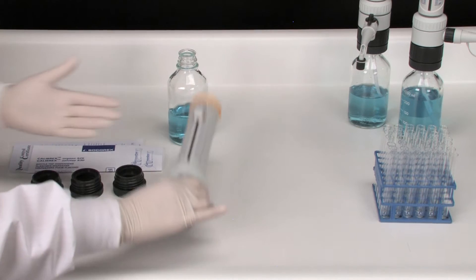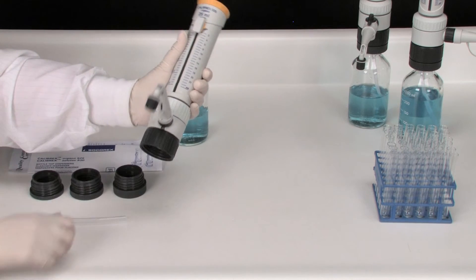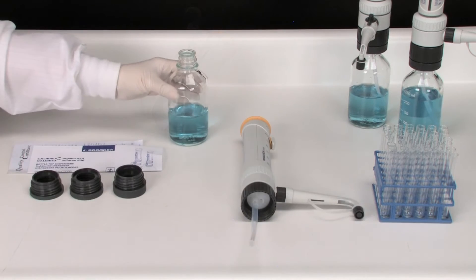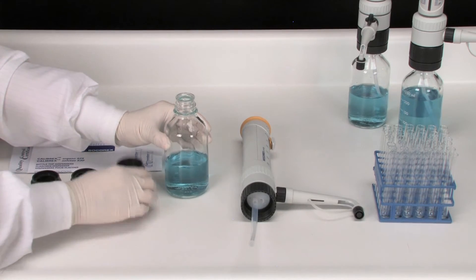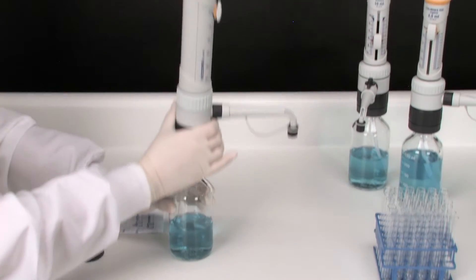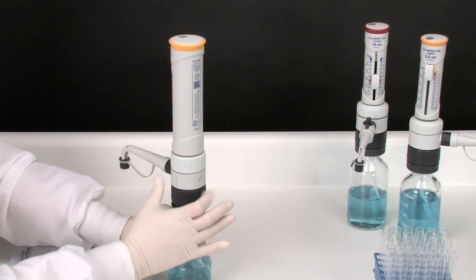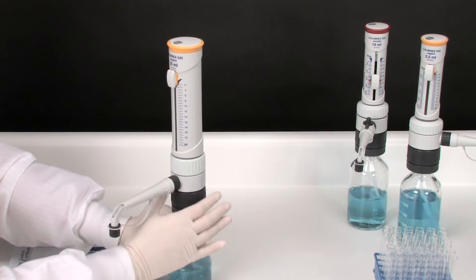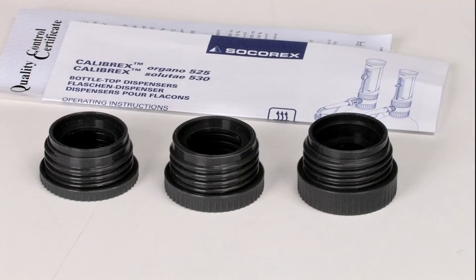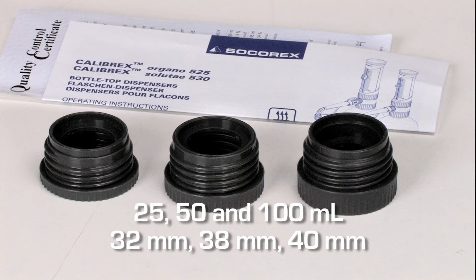Calibrex dispensers are supplied ready to use. Simply attach the delivery jet, connect the feed tubing, apply the appropriate bottleneck adapter if necessary, and screw on the reagent bottle. Bottle fitting is guaranteed on most laboratory bottles thanks to three additional bottleneck adapters supplied in each box.